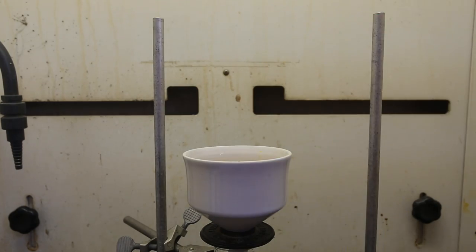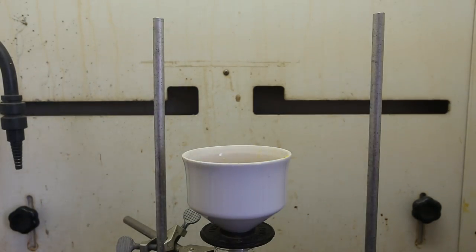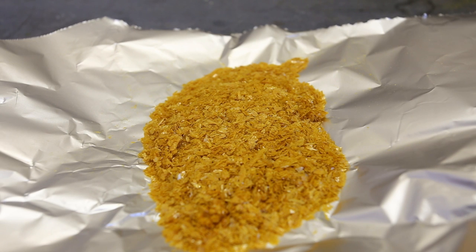The precipitate was vacuum filtered and the beaker was washed with ice-cold ethanol. The product in the Buchner funnel was then washed also with a couple portions of ice-cold ethanol. This is what the final product looked like after letting it dry on vacuum for a little less than an hour. You can easily see that this product is much more yellow than the product obtained after the water recrystallization. However, these crystals still contain a significant amount of ethanol.